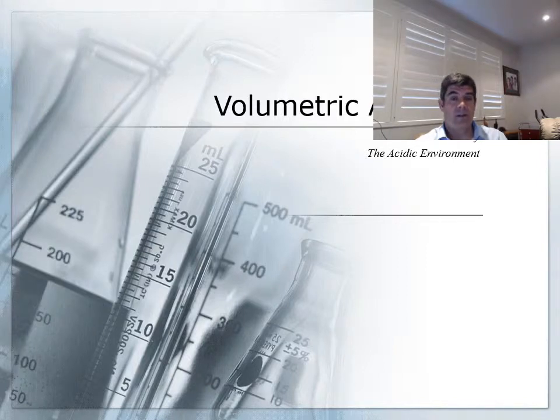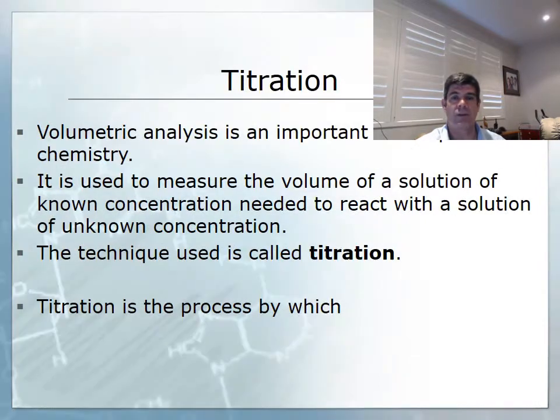Now you guys have been spending a lot of time on volumetric analysis over the last week or so, so you already know a fair bit about this, but I thought we needed to put a couple of videos together to explain some of the techniques a little bit more thoroughly, to identify some of the pitfalls when you're coming to do your practical task, and some things to watch out for. We'll also, in subsequent videos, have a look at some of the calculations involved in volumetric analysis. But at the moment, I really just want to introduce some of the key terms.